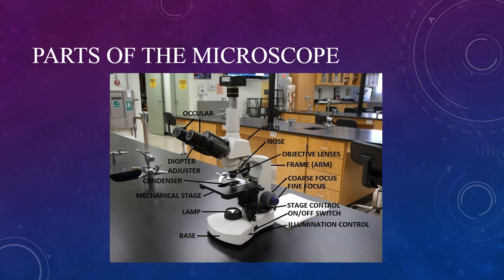The diopter adjuster is the grooved ring that surrounds the ocular, generally on the left side. The head contains the mirrors that reflect light up through the oculars. The nose rotates under the head and houses the objective lenses.